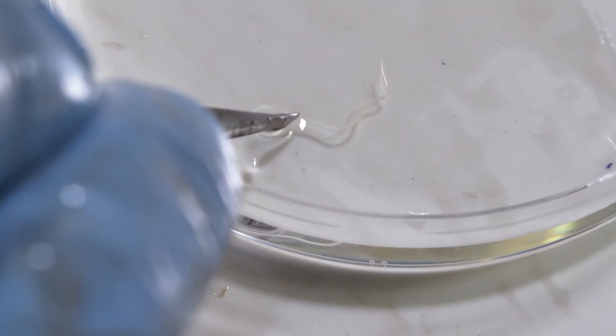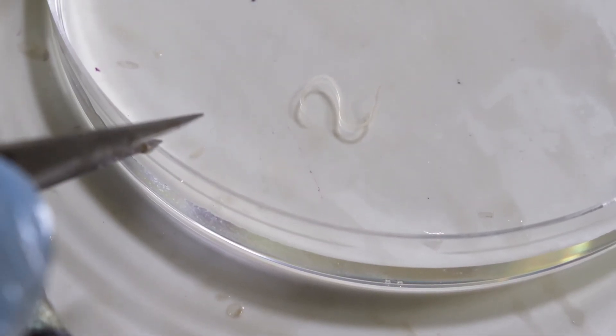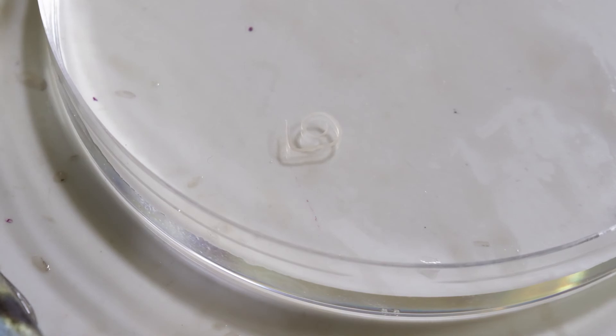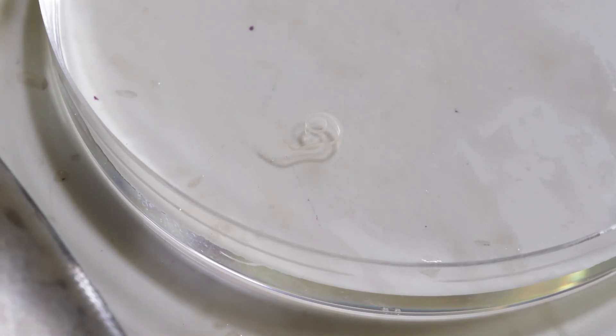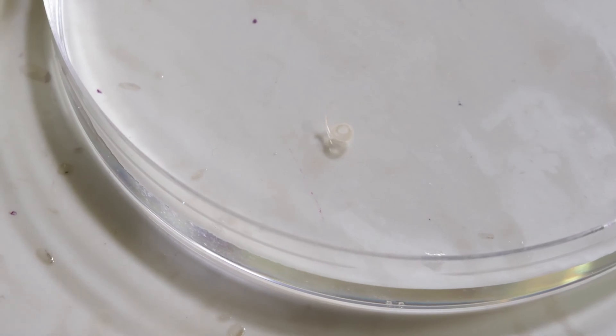This worm has been taken live from this fish and placed into a phosphate buffered saline — an isotonic solution that will promote survival of the worm — and you can see that the worm is quite active in that buffer.